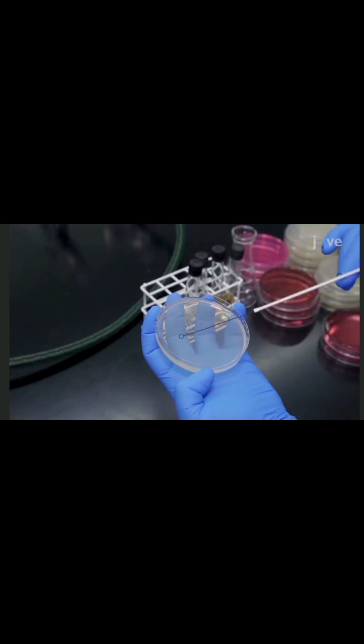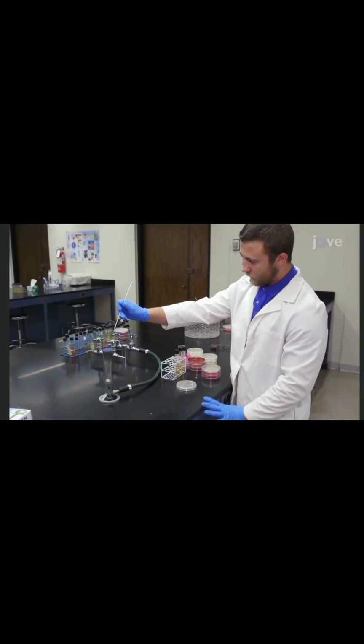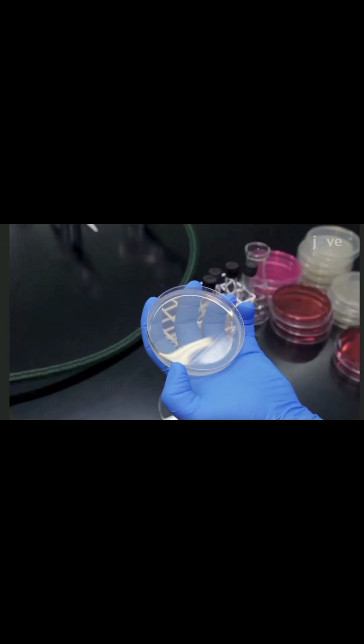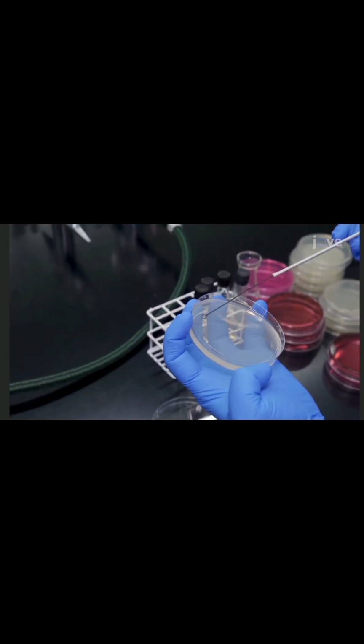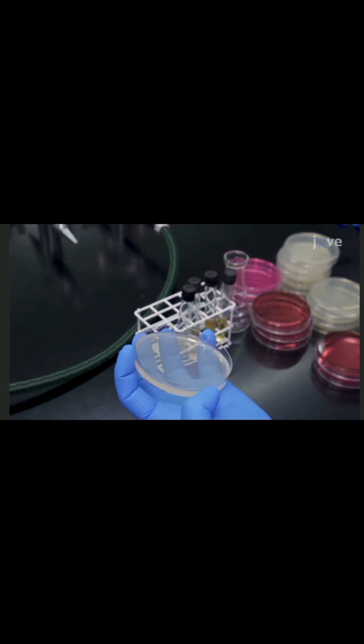Then flame sterilize the loop again and streak the second quadrant. Repeat this action of flame sterilization and then streaking to complete the third and fourth quadrants. Streaking in this manner should give isolated colonies, and also allow for confirmation that the culture is not contaminated.